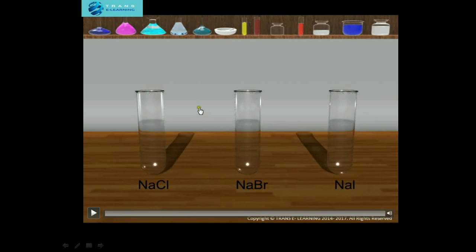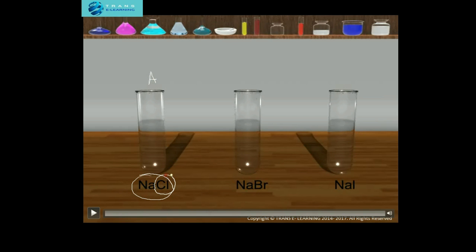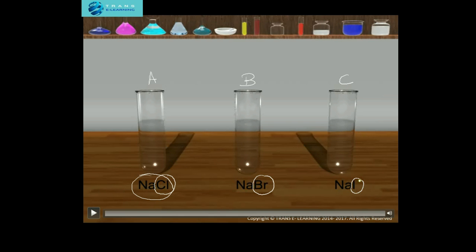You can see here that I have taken three test tubes. This is test tube A, where I have taken sodium chloride which is a clear solution — through this I will be detecting the presence of chloride ion. In test tube B I have taken sodium bromide to detect bromide ion, and in test tube C I have taken sodium iodide solution to detect iodide ion.